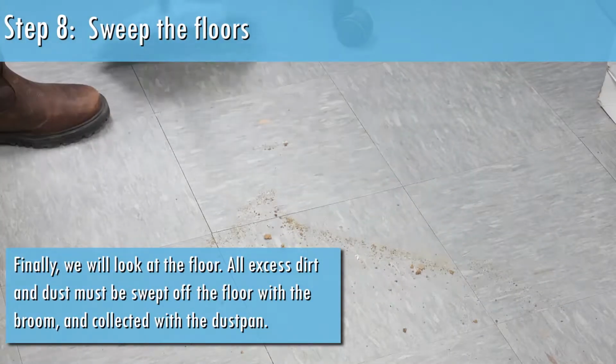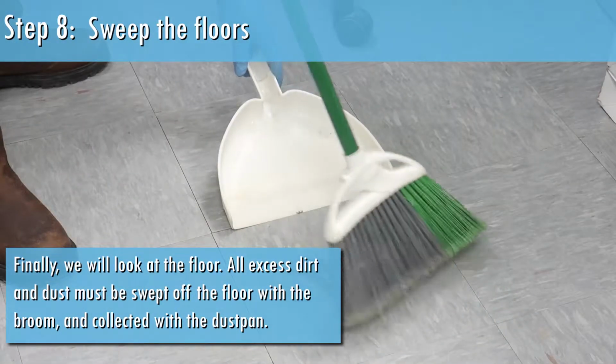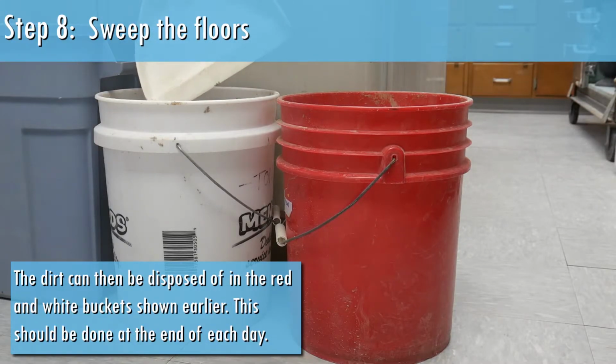Finally, we will look at the floor. All excess dirt and dust must be swept off the floor with a broom and collected with the dustpan. The dirt then can be disposed of in the red and white buckets shown earlier. This should be done at the end of the day.